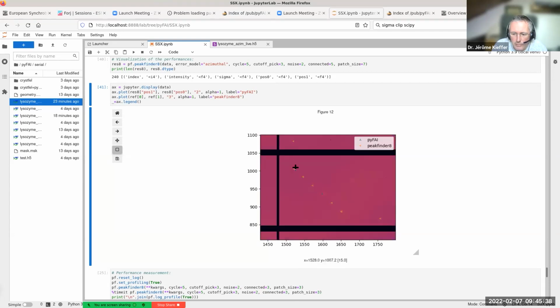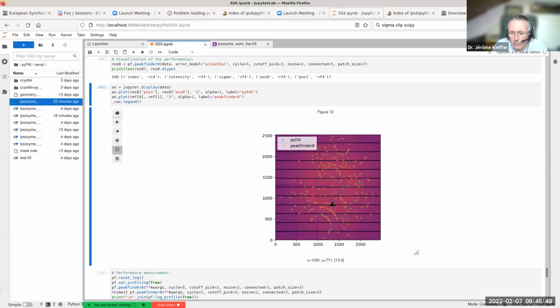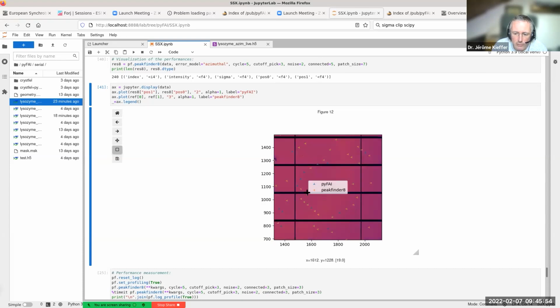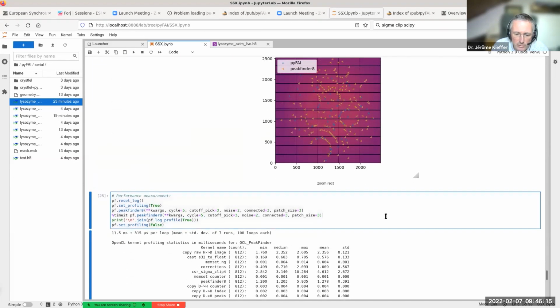If you look at this series here, this one was not spotted by the version from Cheetah. I don't claim that the version I've made is better, because I don't know how to use the version from Cheetah, but I'm pretty happy with the result, and I was honestly surprised to obtain better results. It's, let's say, something that works.